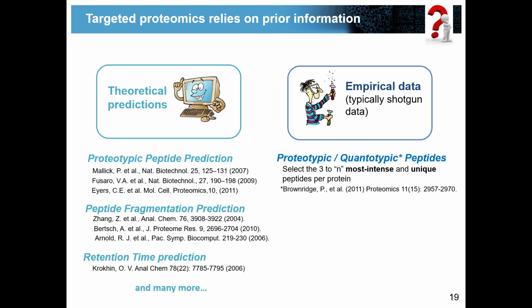A peptide for quantification? Yeah? But what does it mean? I mean, proteotypic peptides are also peptides for quantification. Yeah? It's probably sequence dependent. So if we have new fragments, I would have anything like methionine that would be oxidized. Yes. Very good.